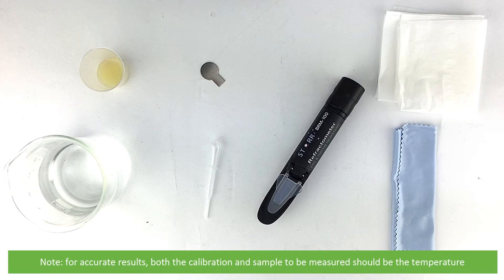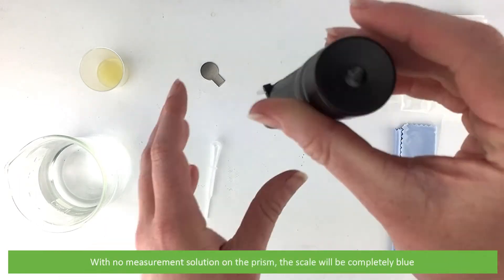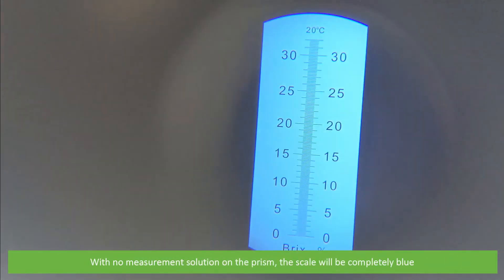For accurate results, both the calibration and sample to be measured should be the same temperature. With no measurement solution on the prism, the scale will be completely blue.